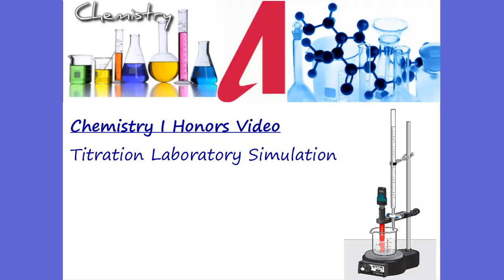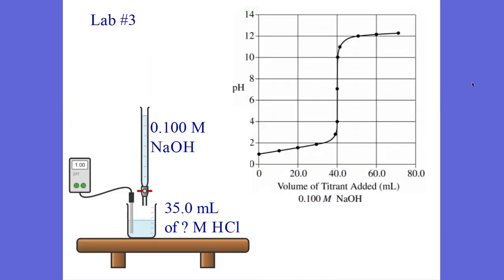Let's go to lab number three. Lab number three is, we're not doing an end point lab. We're doing an equivalence point lab. You can see right here, I start off with a pH of one of my acid. I have 35 milliliters of, I don't know what my acid is. That's what I'm trying to find.